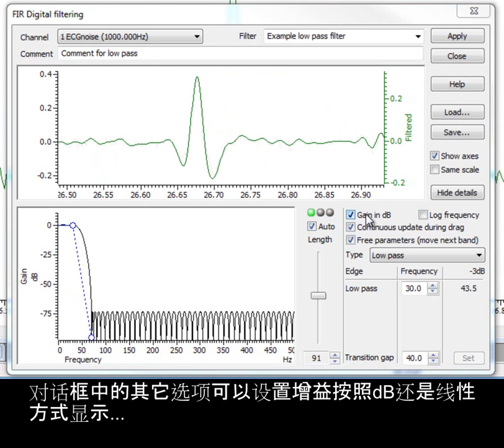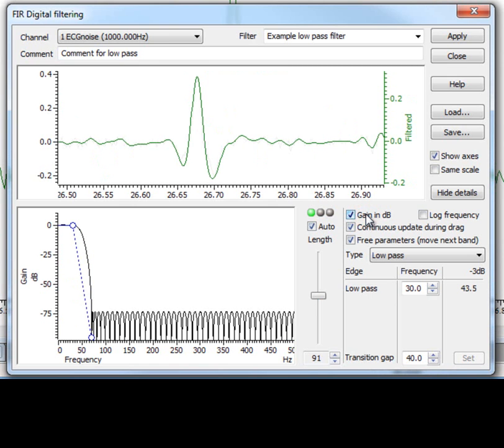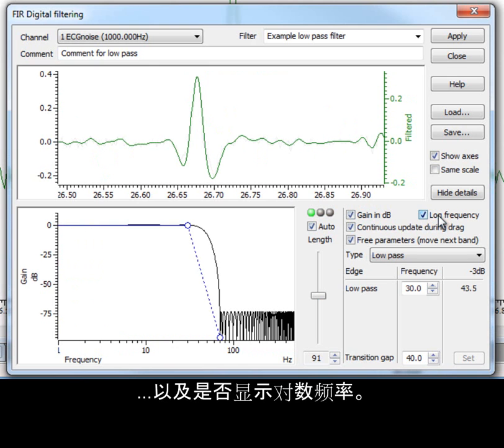The other options in the dialog allow the display of gain in dB or linearly, and display the logarithmic frequency.